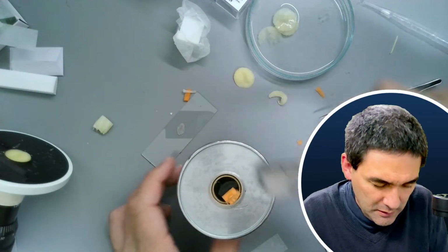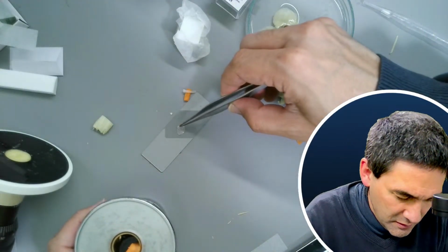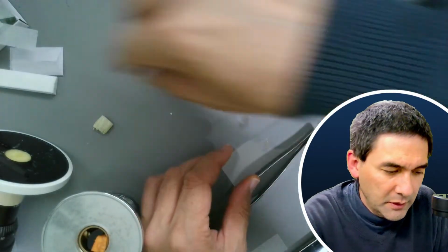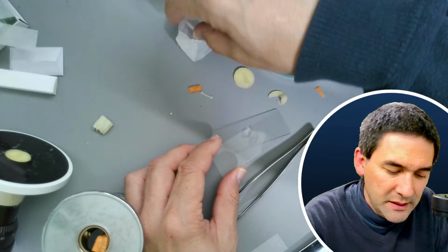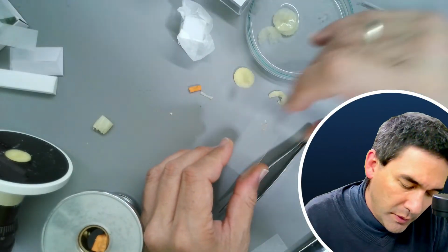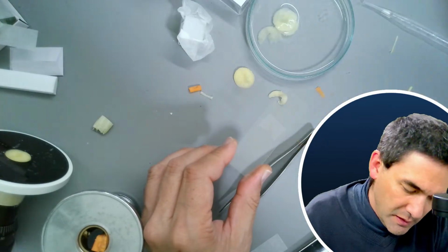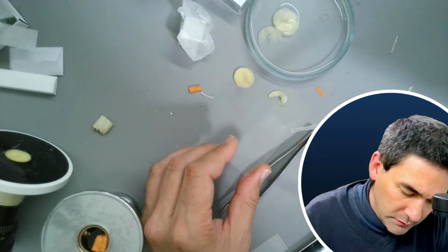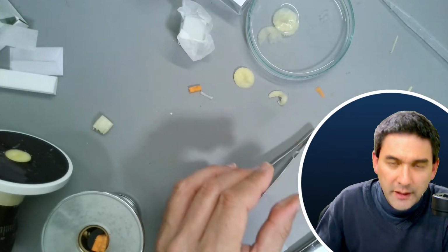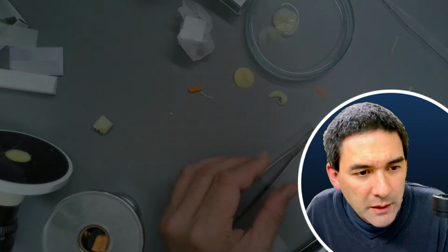Okay, here it is. Very thin. Yeah. And I put a cover glass on top. The problem is I don't have my reading glasses, so I cannot really see quite well in which direction it's lying. Okay, I might add more water. And let's give it a try again. Okay, so where is the microscope?